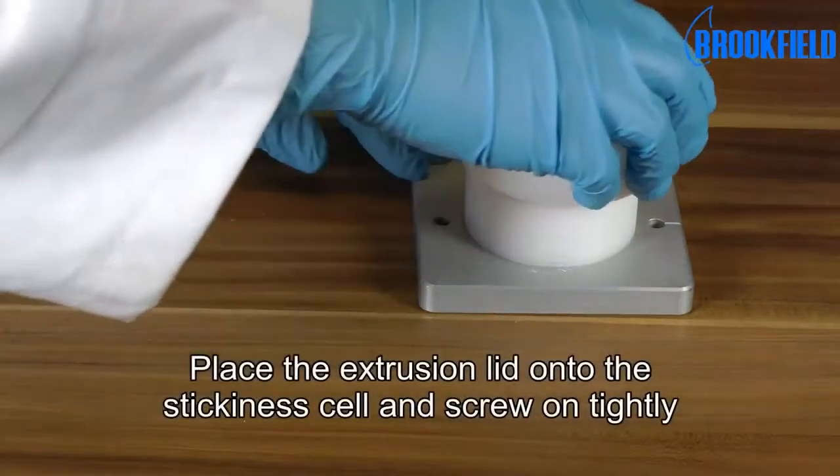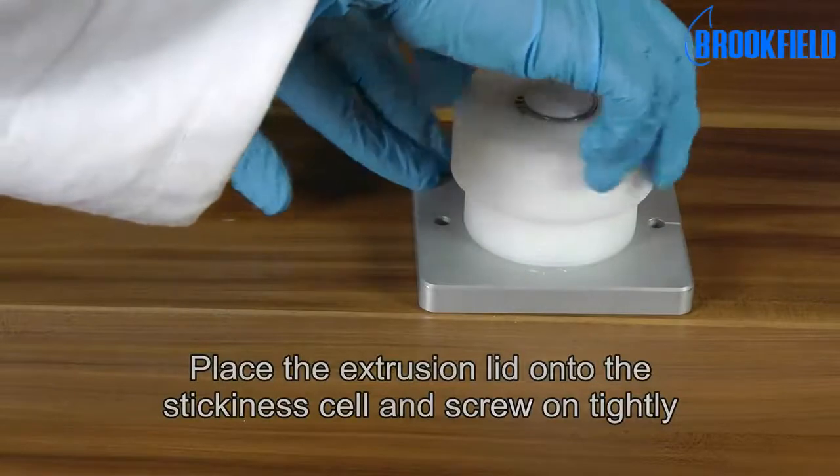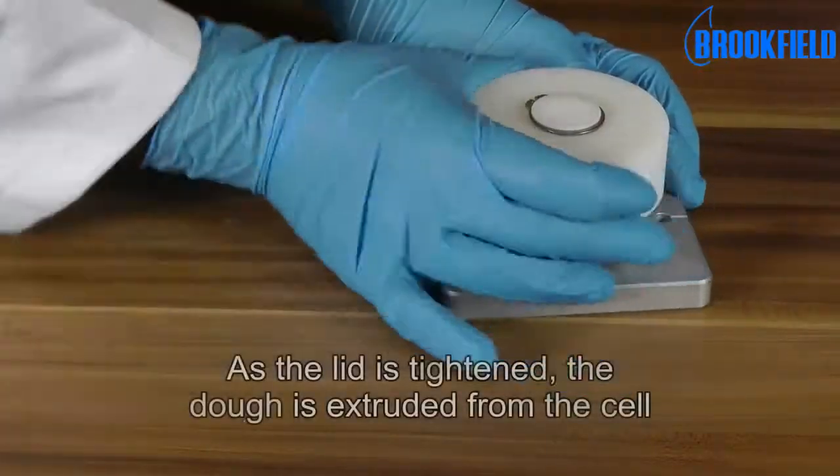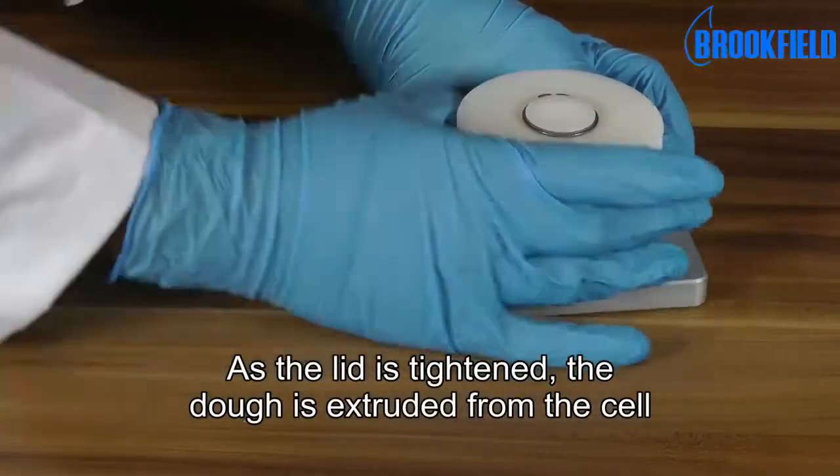Place the extrusion lid onto the stickiness cell and screw on tightly. As the lid is tightened, the dough is extruded from the cell.